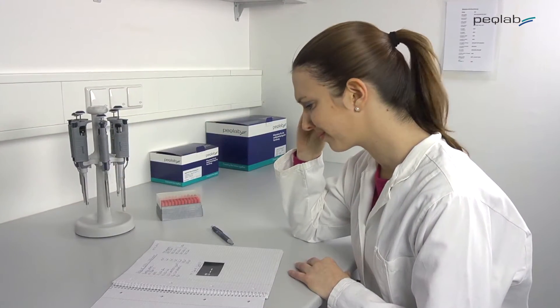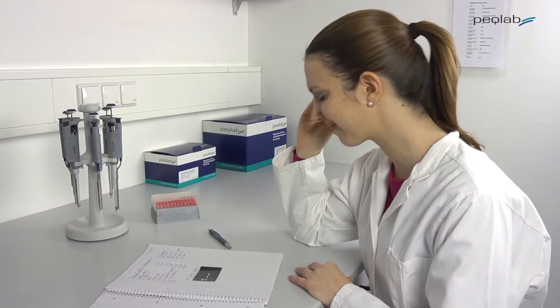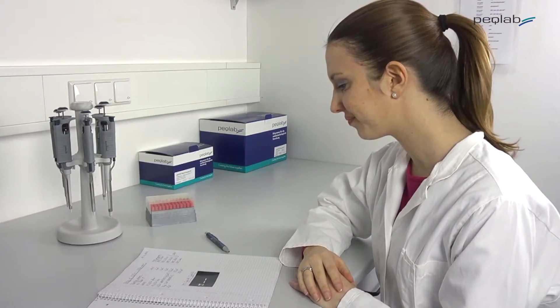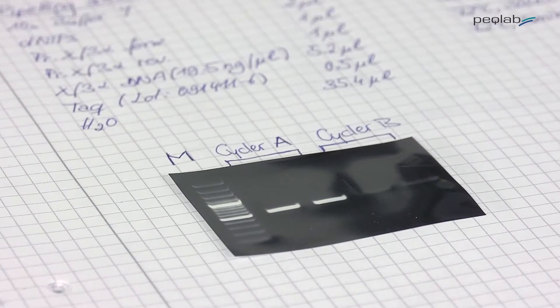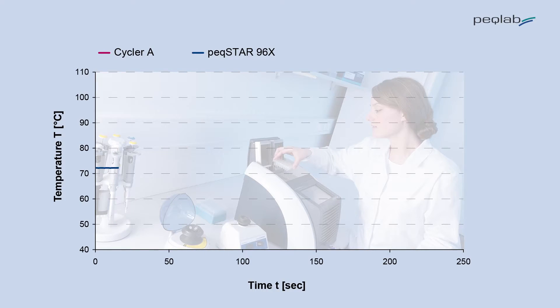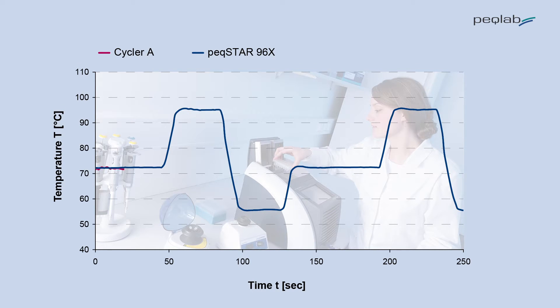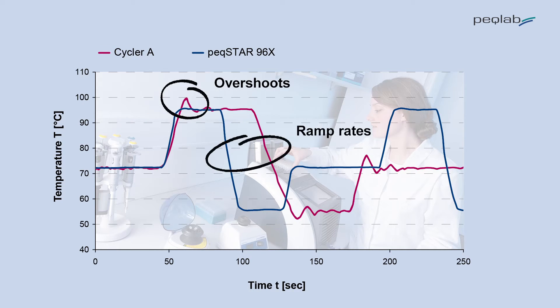When evaluating different thermal cyclers in your lab, you may see apparently identical PCR protocols producing different PCR results. Here's a comparison of the PCR temperature profile from a PECSTAR 96X and another well-known brand. Due to different control systems specific for each instrument, individual temperature profiles are produced, and this can have a drastic effect on the PCR results.